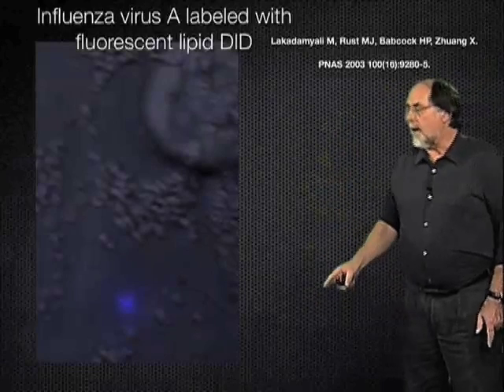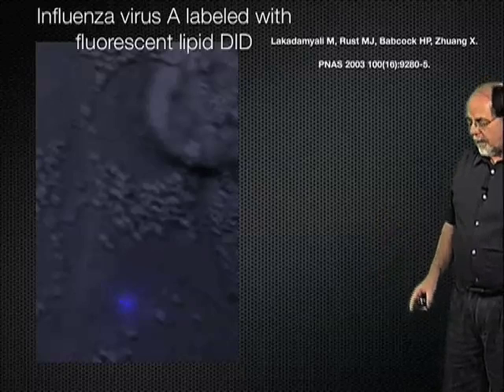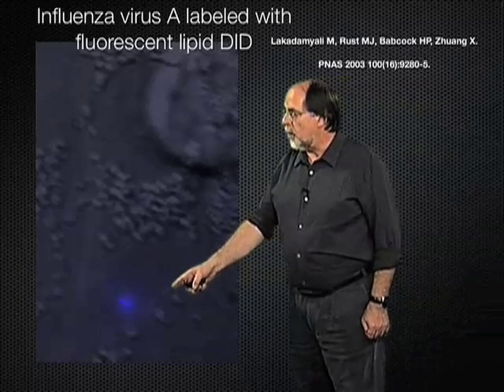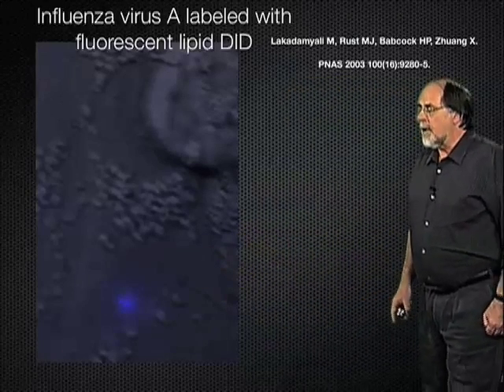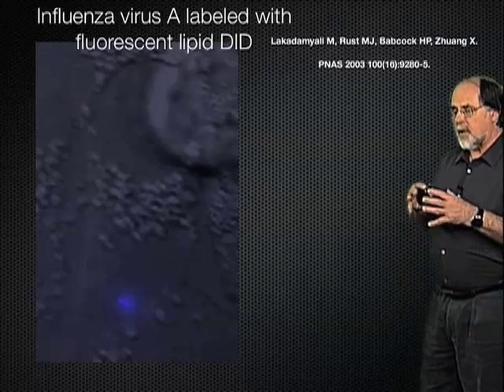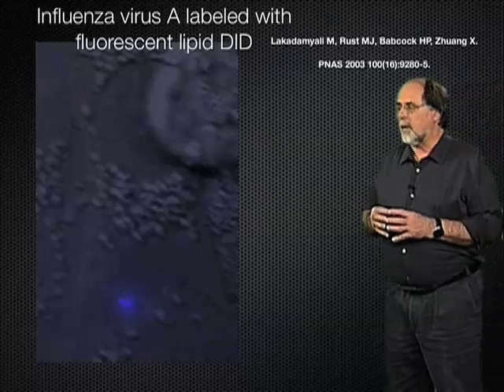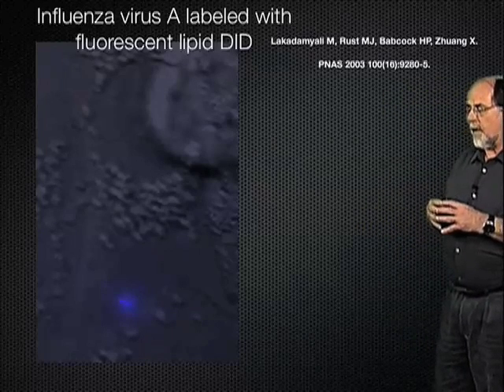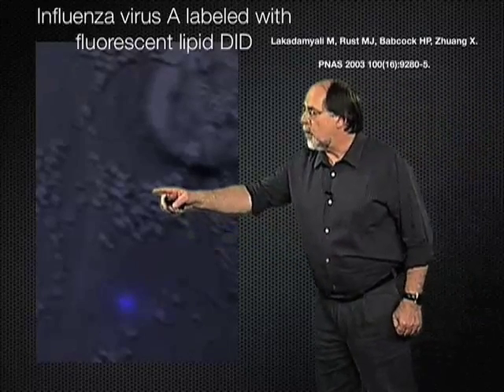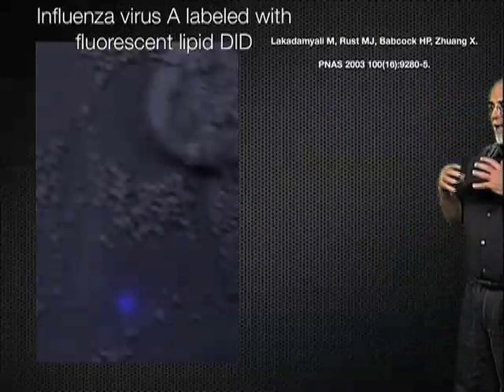Work from Laka Dymiali and others has allowed us to see this event in a real cell context. What you see here is an influenza virus particle in which the membrane envelope has been doped with a fluorescent lipid at such high concentrations that it is almost completely quenched. The fluorescence is not coming out of that particle, but when the membrane fuses with the larger membrane of a late endosome, the fluorescence increases and you can see a flash of fluorescence forming.